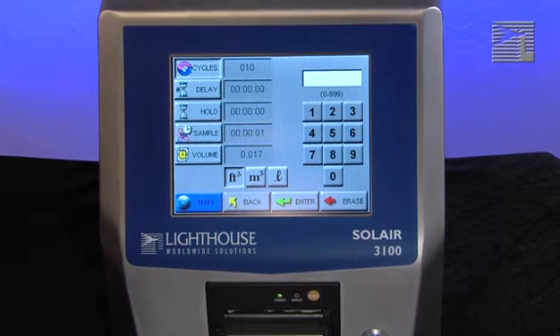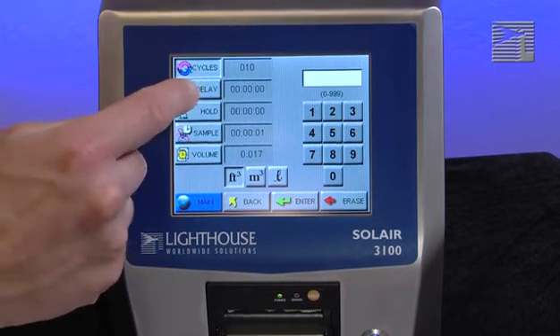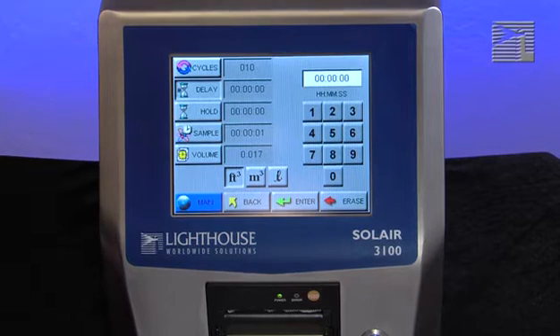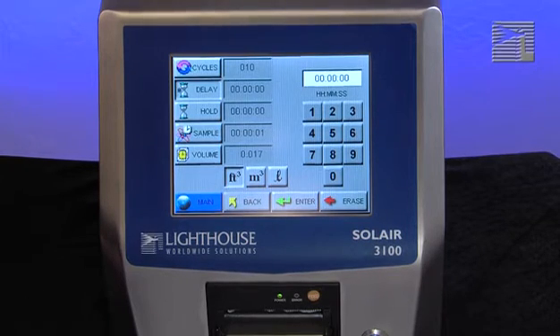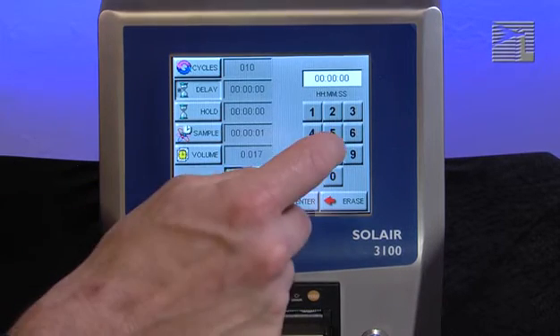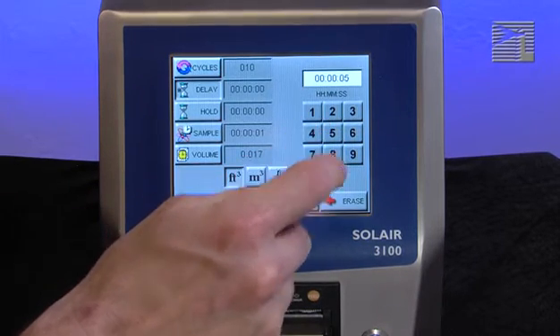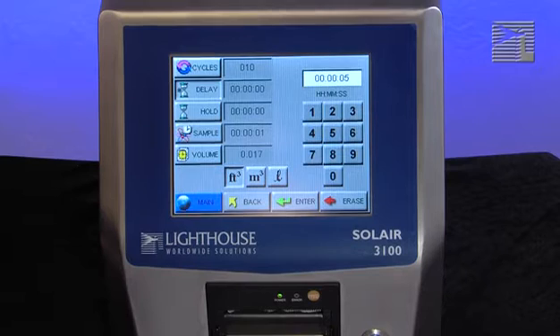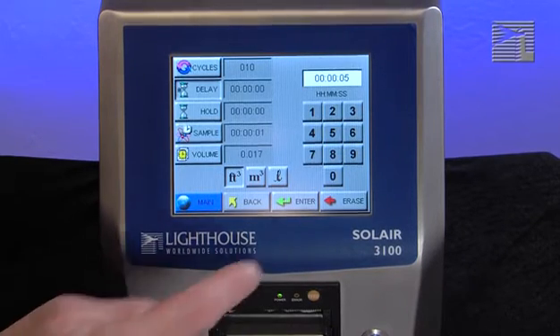The initial start delay is the time between pressing the start button and the unit actually starting to count. Enter the initial delay time in hours, minutes, and seconds using the numeric keypad on the right. After the value is input, press enter.